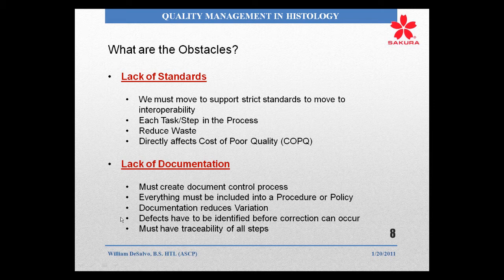So we talk about lack of standards. Each task, each step in the process, you've got to try to reduce waste. You need to understand what directly affects your cost of poor quality. If you don't have that number, that equation, that factor now in your laboratory, I suggest you learn more about it. It's difficult for us to discuss this here in just 1 hour, but cost of poor quality is just a killer in your laboratory.